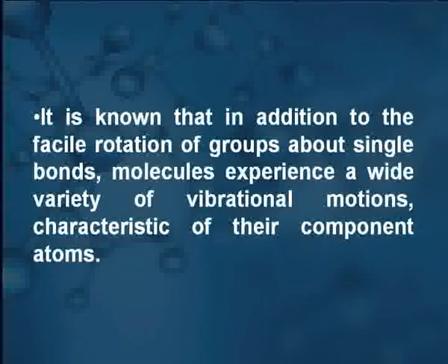It is also known that, in addition, with the facile rotation of the groups about the single bonds, a molecule experiences a wide variety of vibrational motions. So characterization of the compounds can be done by using IR spectroscopy. We can find out various properties or various characterizations.